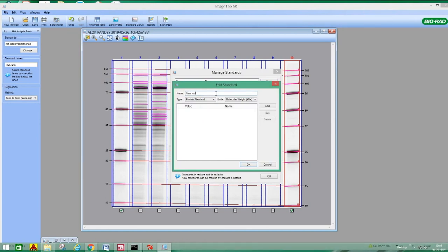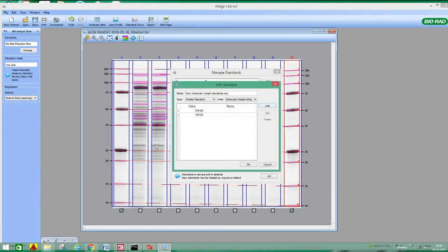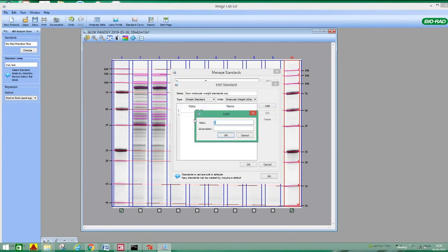Just go to new standard, and you can give the name. Suppose I am giving new molecular weight standards, something like XXY, some company's name. After that you have to add each and every band. Suppose the first one, I'm just giving these values for convenience, 250, and the second band is 150. It need not be these values; whatever your choice of marker is, you can give those kD values. You need not worry about what it has written, it will automatically disappear.